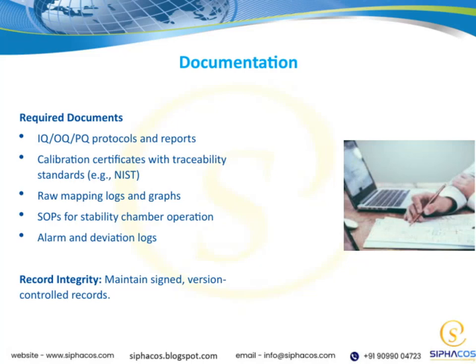Now, let's talk about the documentation we need to keep on hand. First, we have the IQ, OQ, and PQ protocols and reports. These are essential for demonstrating that equipment has been installed, qualified, and performs according to specifications. It's important to keep these reports well organized and accessible.